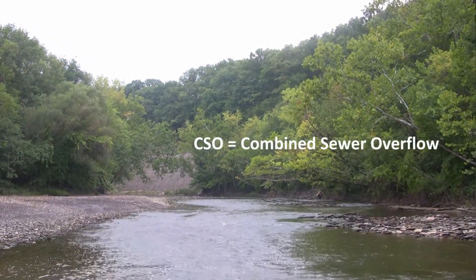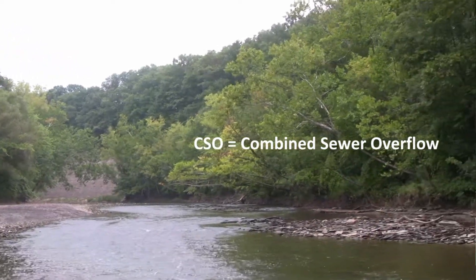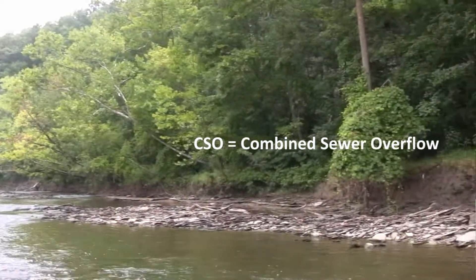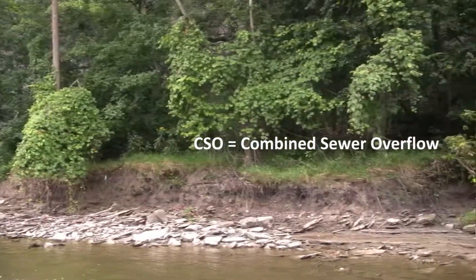What we're doing is we're sampling downstream, just to see if our CSOs are impacting the main stem. We'll be able to tell if there are any exceedances of heavy metals or anything else like that.